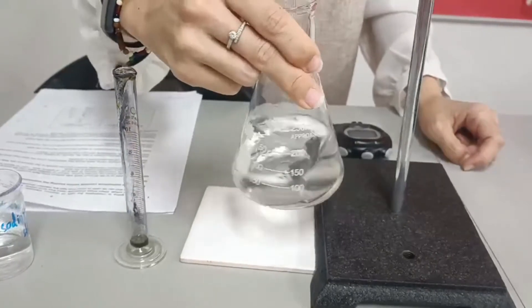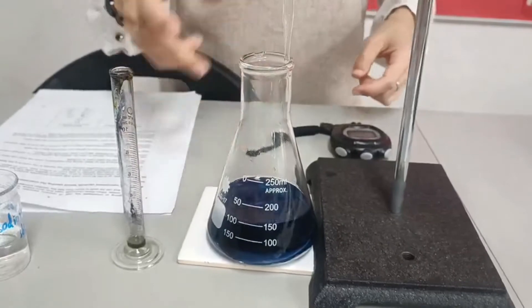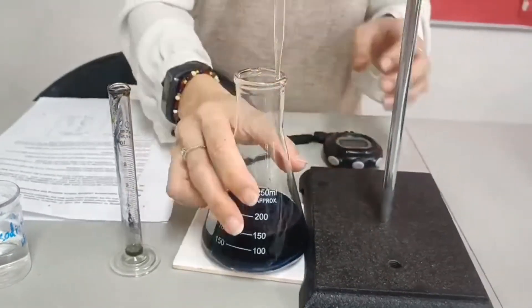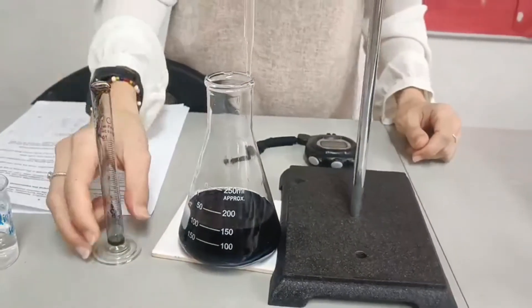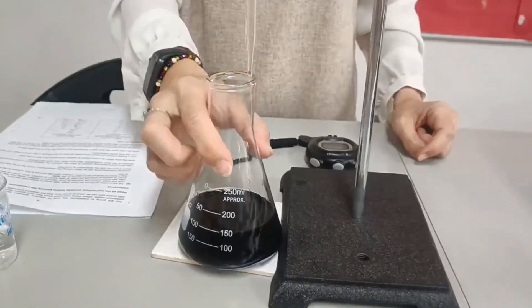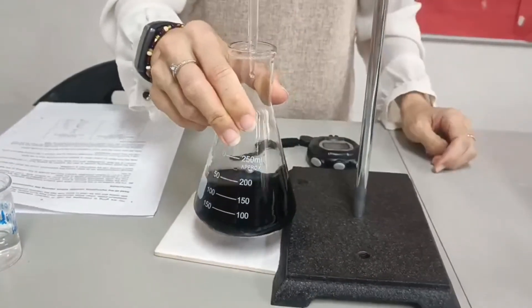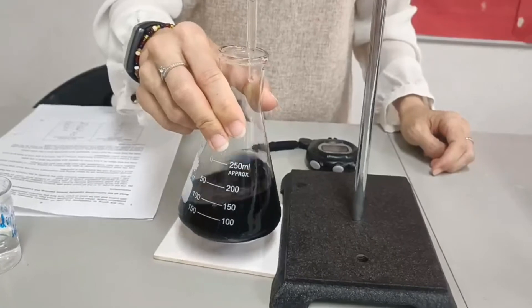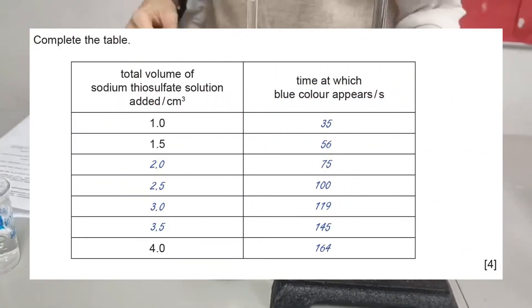So, as I said before, as you add the thiosulfate, you have to keep on swirling. You cannot put it down and add and then swirl because it will be too late for you and you cannot see the color change. You keep on swirling while adding the thiosulfate 0.5 ml at each time. Good luck.